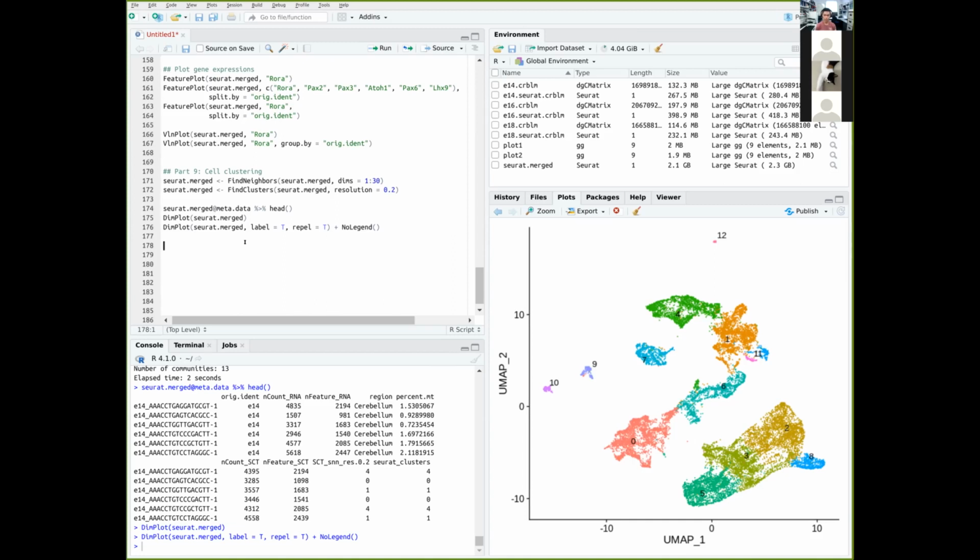I will show you an example later on a link to perform this. But essentially, this is very powerful because it allows you to do a lot of downstream experiments, a lot of downstream analysis using the information from each gene marker. Okay, I'm gonna just relabel this as a new part. I lost count, probably part 10, identifying gene markers.